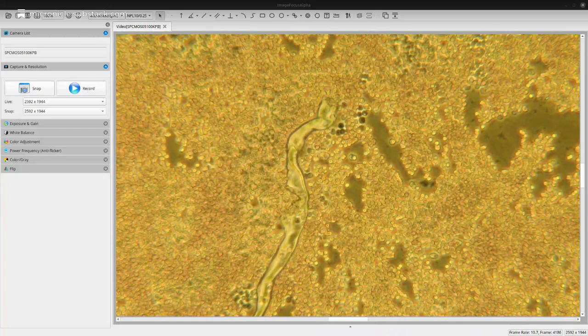Anyway, all that aside, this is more about what it looks like. First of all, just with phase contrast, and then I'm going to use cross polarizers, because whatever this is, it's strongly birefringent, which could be a clue. Okay.